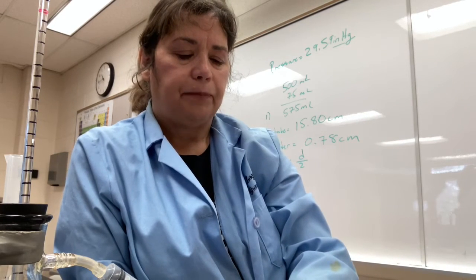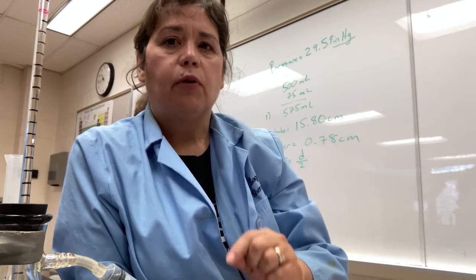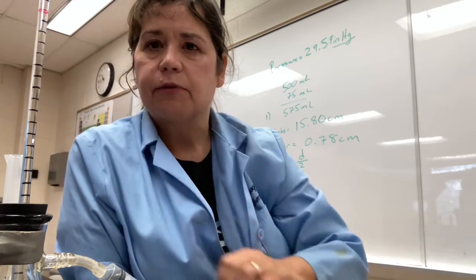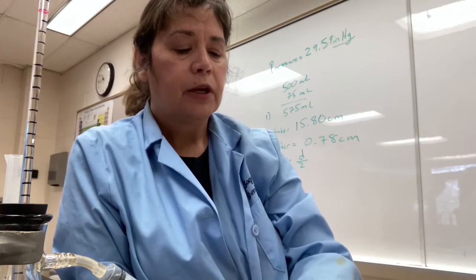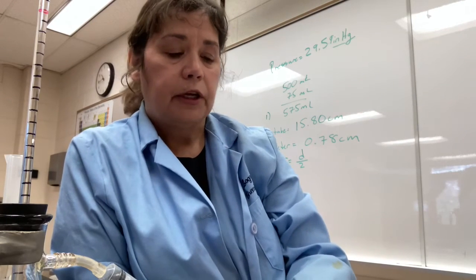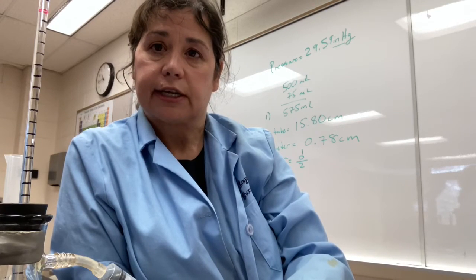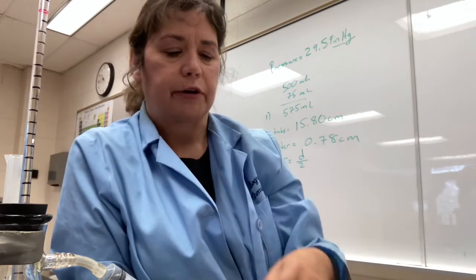So to do that, you use the ratio of the two densities. Mercury is 13.6 times more dense than water, so we have to divide the water levels by 13.6 to convert it over to what the heights would have been for mercury. So if you see column D, you're going to take your numbers in column C and divide by 13.6, just like it says. But that's why, because we're converting over to what it would have been if we used mercury.